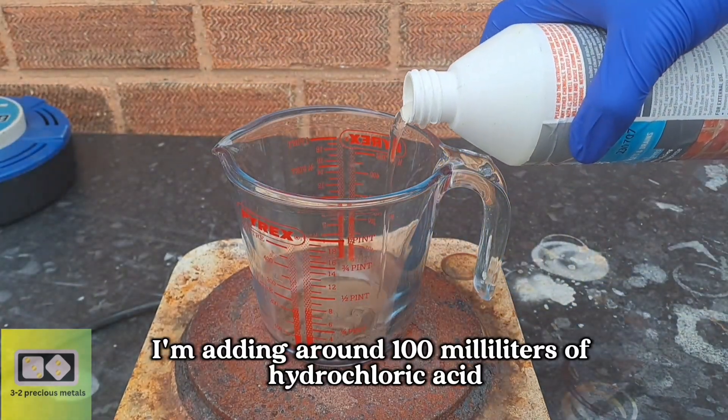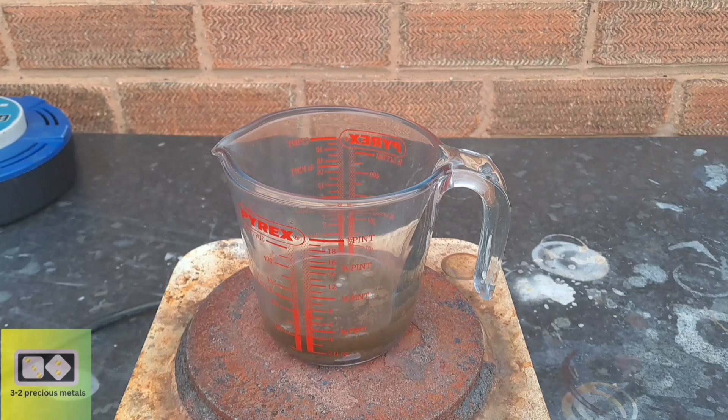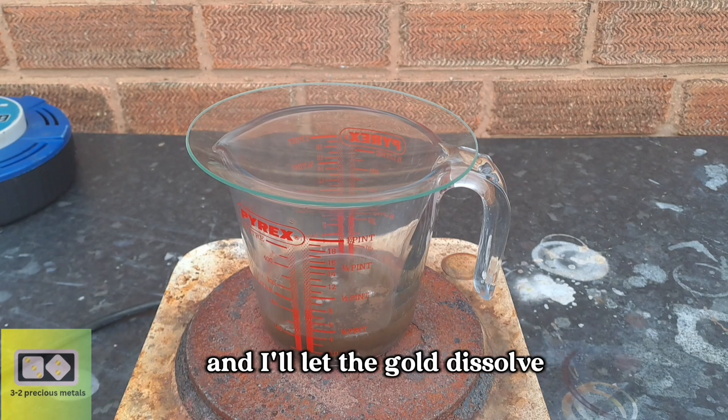First, I'm adding around 100 milliliters of hydrochloric acid, along with a good heaped teaspoon of potassium nitrate. This produces what's known as poor man's aqua regia. I've set the hot plate to a low setting, and I'll let the gold dissolve.